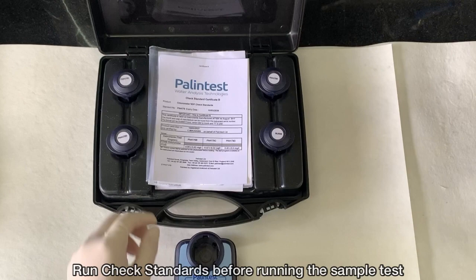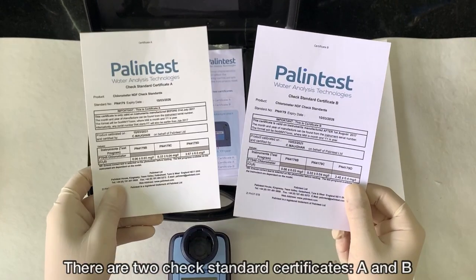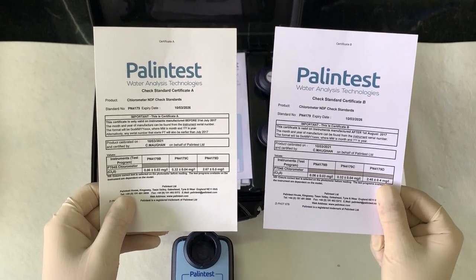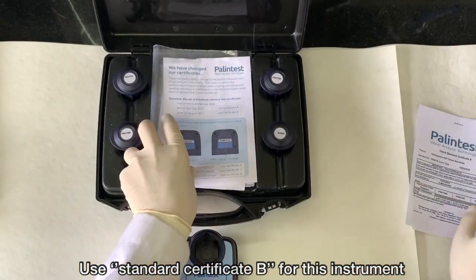Always make sure to read the user manual before using the meter. Run check standards before running the sample test to ensure that your meter is giving you the correct result. There are two check standard certificates, A and B. Use standard certificate B for this instrument.